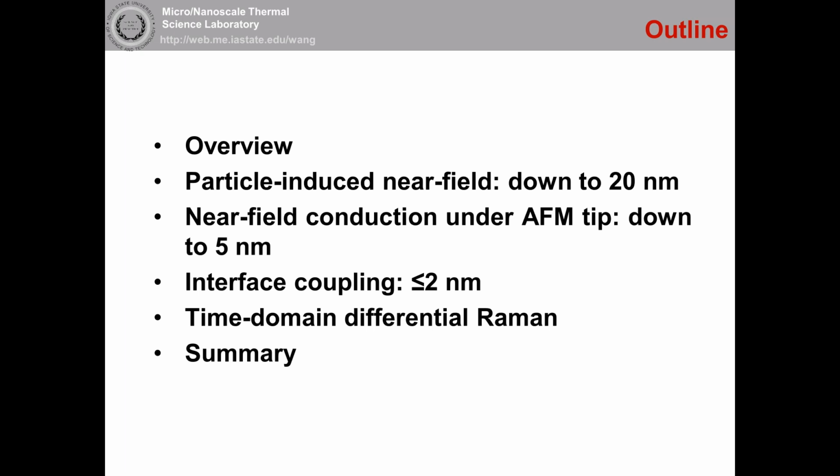time domain differential Raman, because right now for Raman spectroscopy, people use a CW laser. It's like the laser is irradiating the surface all the time. So we change the way the laser irradiates the surface to study some transient phenomena.